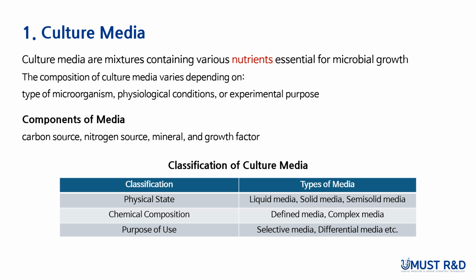Lastly, culture media can be classified based on their purpose. Selective media is designed to isolate specific microorganisms from mixed culture, while differential media helps to distinguish microorganisms based on visible characteristics such as color changes in the medium.